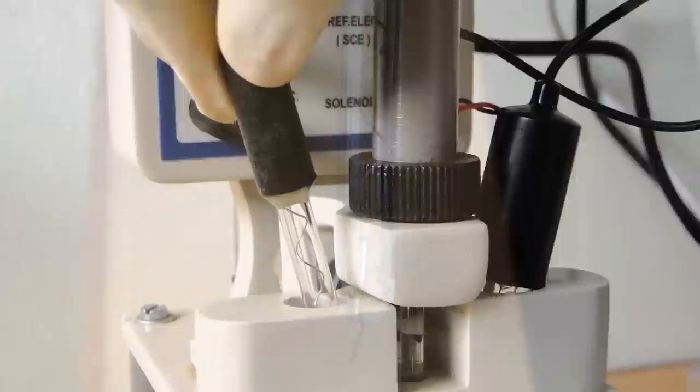Now fill mercury into the Tygon tube through the mercury reservoir bulb. Adjust the drop set and scan the sample.